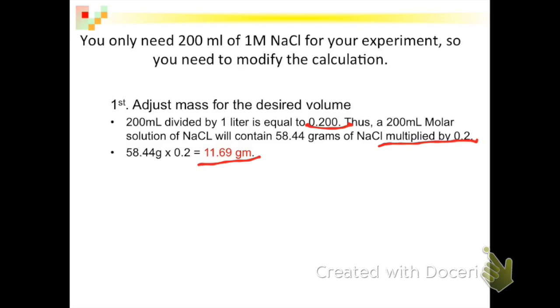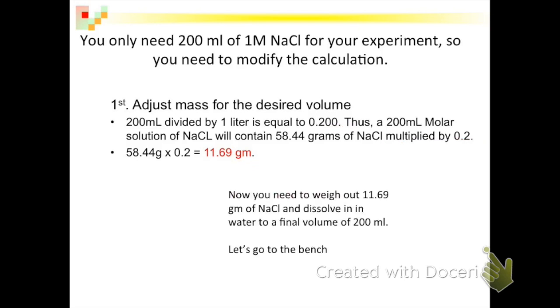Now our next step is we need to weigh out 11.69 grams of sodium chloride and dissolve it in water for a final volume of 200 milliliters. To do this, we need to go to the bench and see how that works.